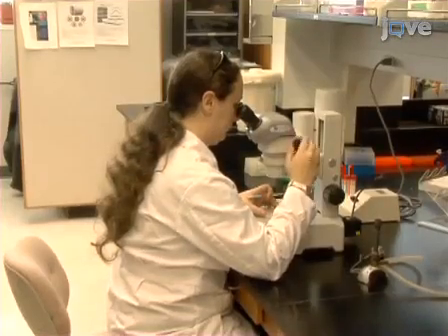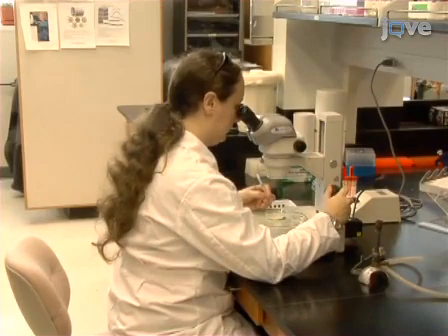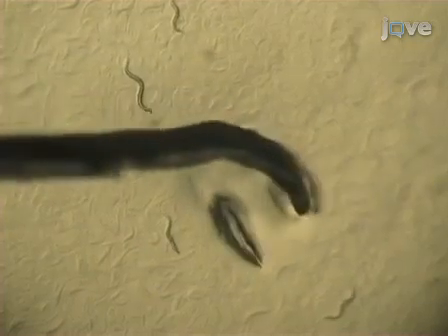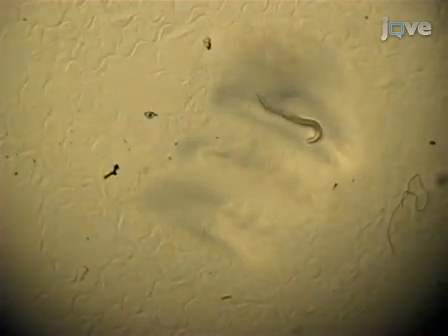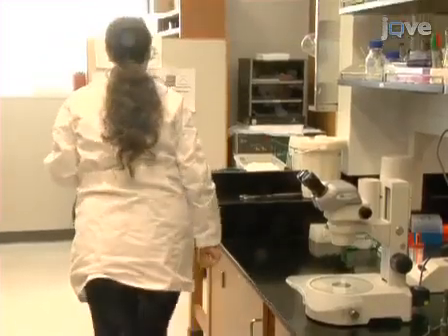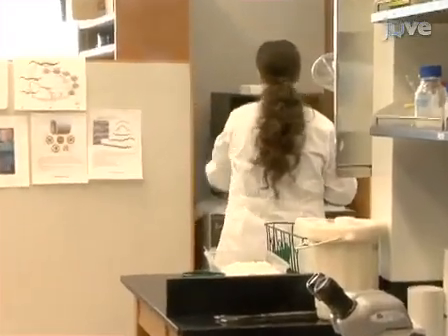For this experiment, grow nematodes on NGM agar plates seeded with an OP50 bacterial lawn at 25 degrees Celsius. The day before the experiment, pick at least 40 L4 larvae onto seeded plates and incubate them overnight at 25 degrees Celsius. These worms will be young adults for the experiment.